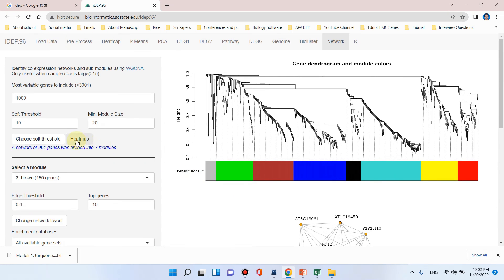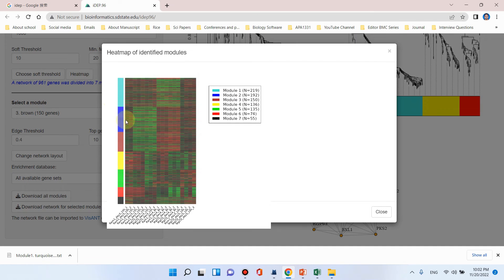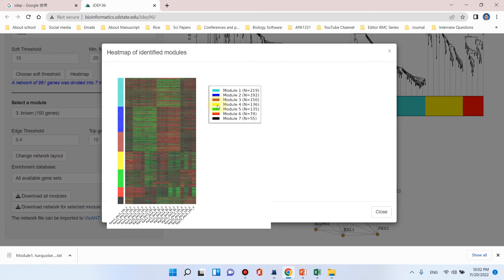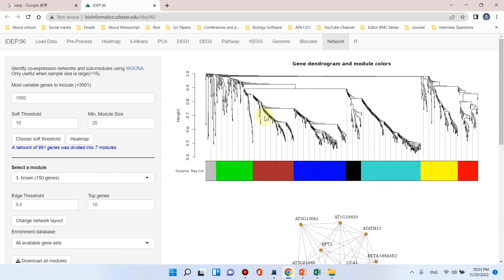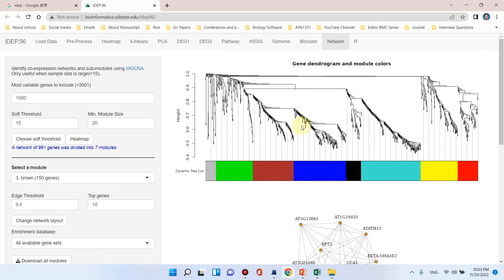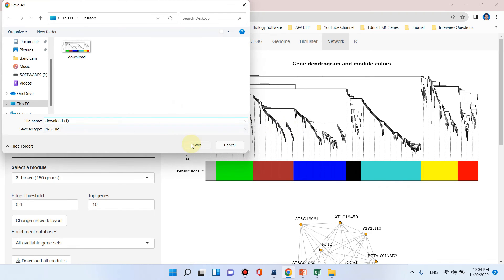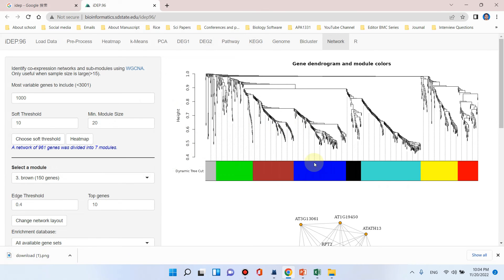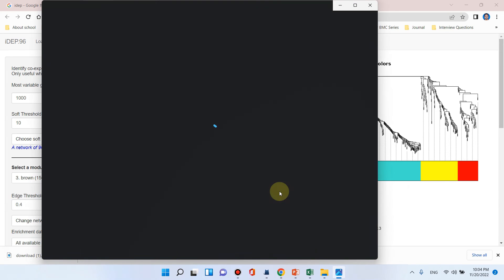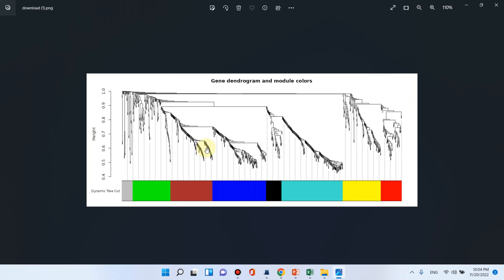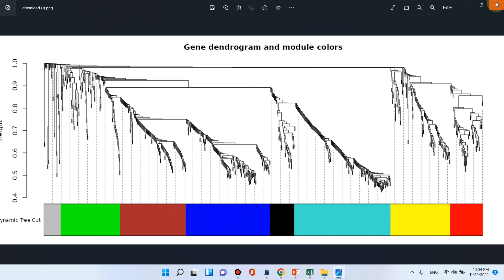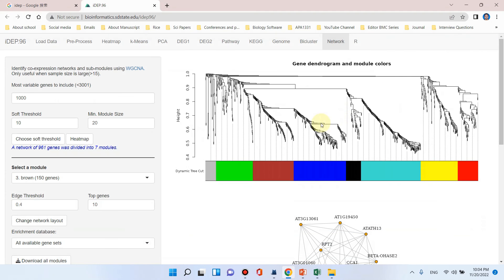If you want to compare all the genes of all modules you can simply click on this heat map. A heat map of identified modules has already been generated. Each module is being represented through one unique color and here are the types of treatment of the sample which we uploaded previously. If you want to save this gene dendrogram and module colors of this dynamic tree cut, you can simply click here and save this dendrogram as an individual figure and use it in your publications. The gene dendrogram has been saved in high quality resolution.